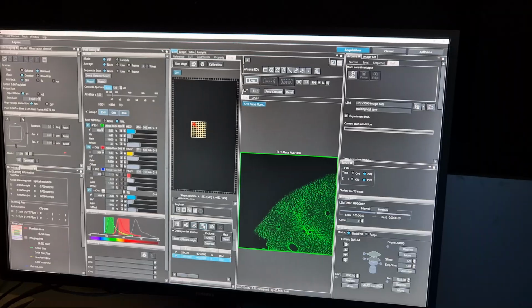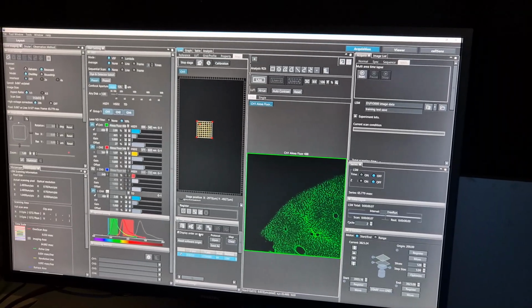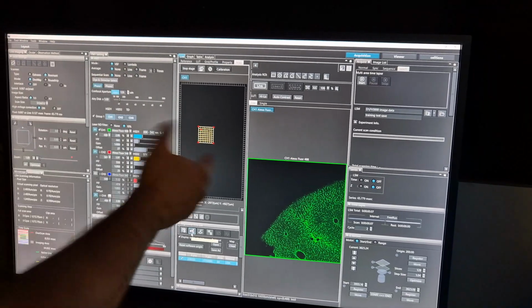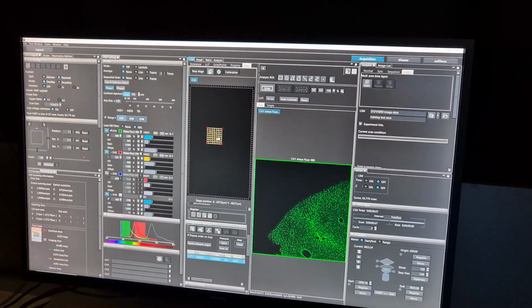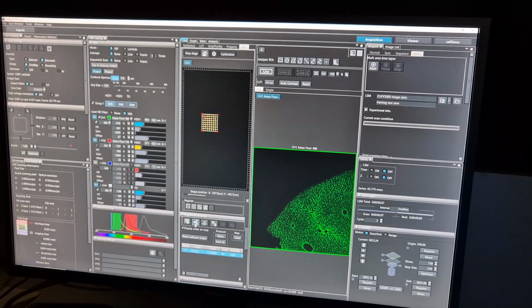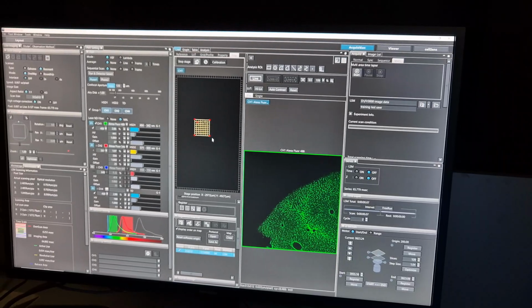So delete that. Ideally, do all the settings first. One thing I had on was I was using frame averaging. I don't care about averaging for this map, it's just a map. So I turned that off, and now I need to highlight the registered area either by clicking this line or clicking on the box and say update registered acquisition parameters, and that's it.